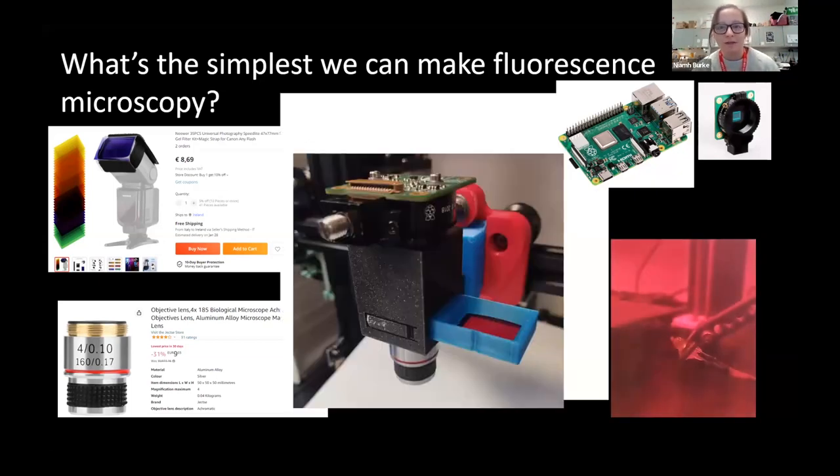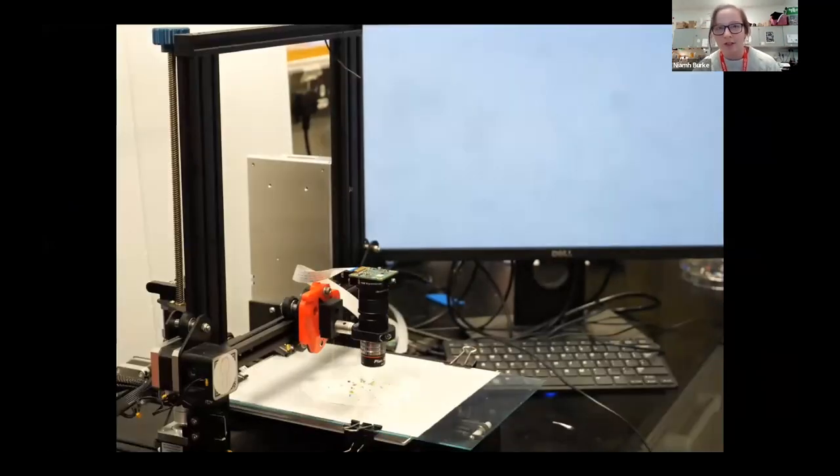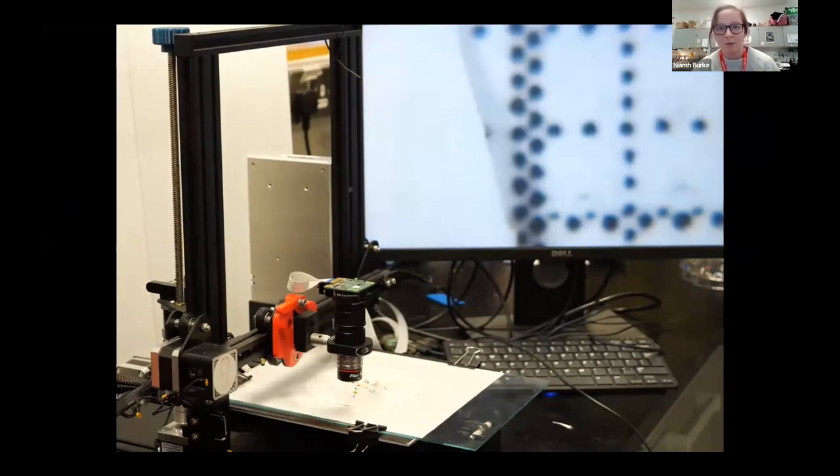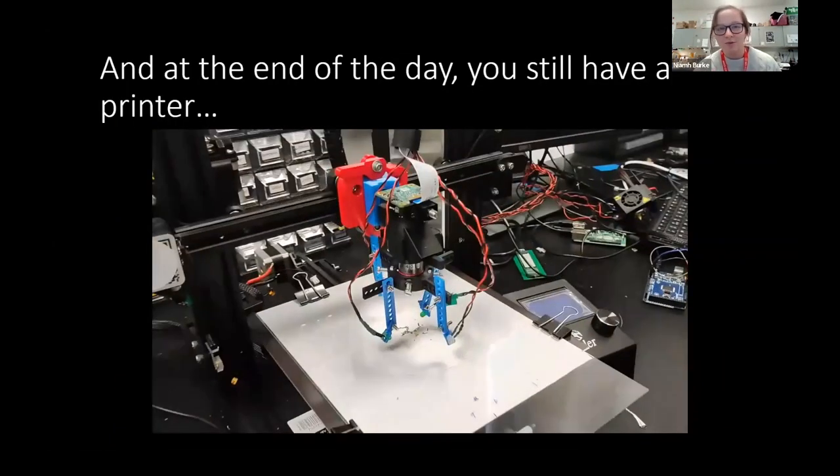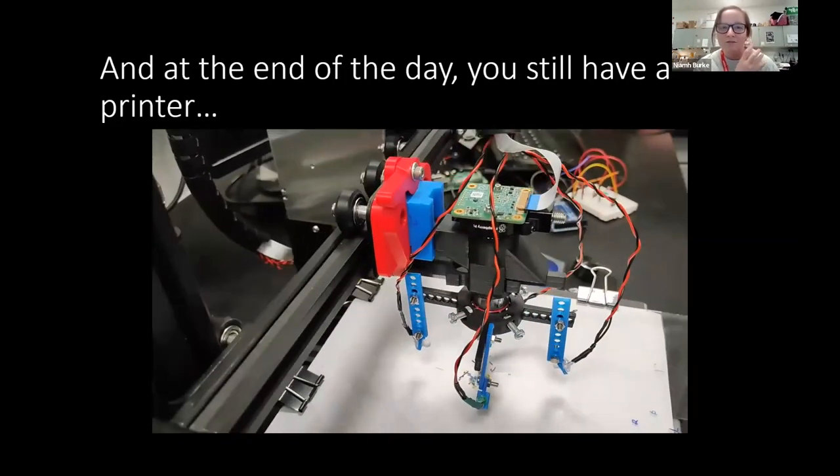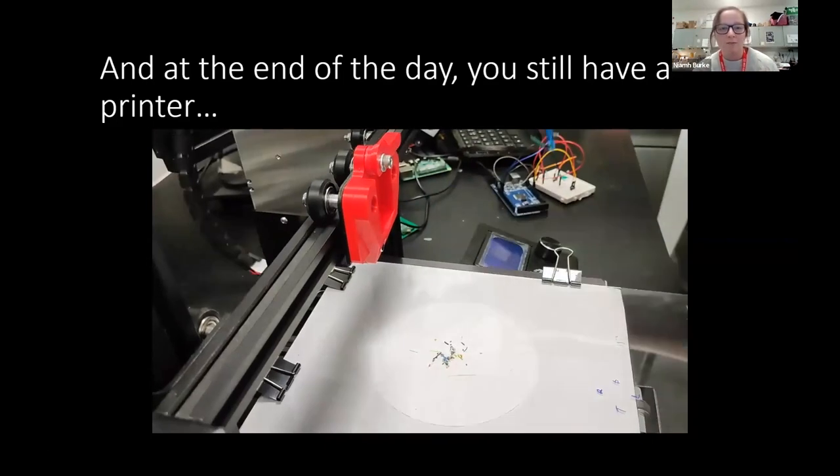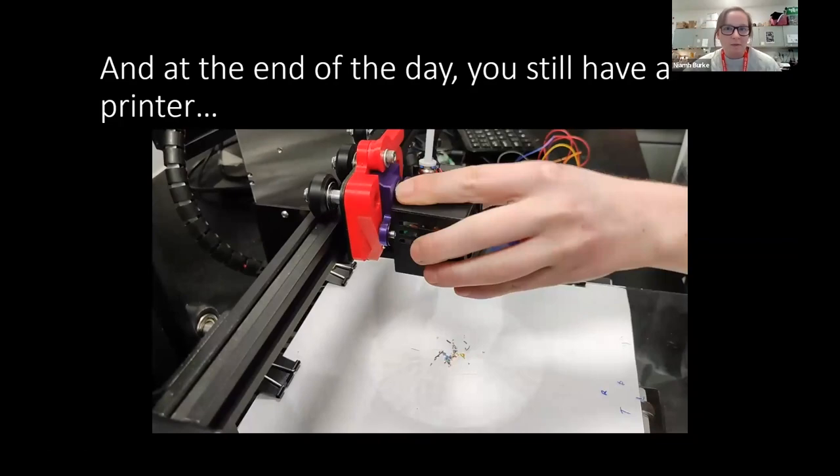We're just going to 3D print all the other bits. Now we have a super simple fluorescence microscope that we can just stick onto our 3D printer, and we have the Endoscope. The best thing about this is that you keep the 3D printer intact, so you can still have your 3D printer. We've designed a tool that allows you to swap back and forth between 3D printer and microscope really easily.